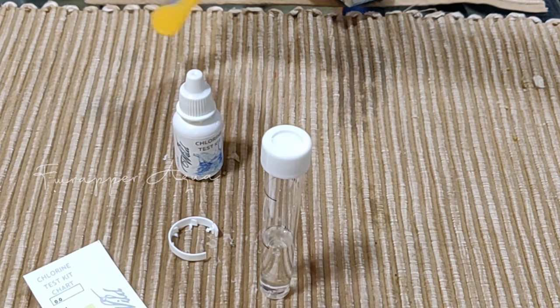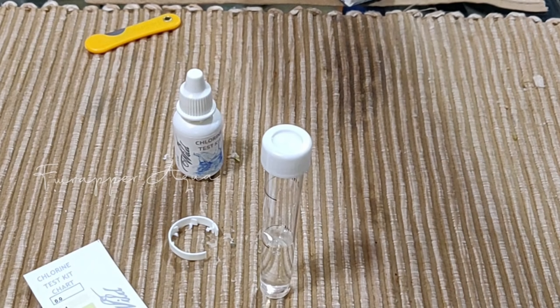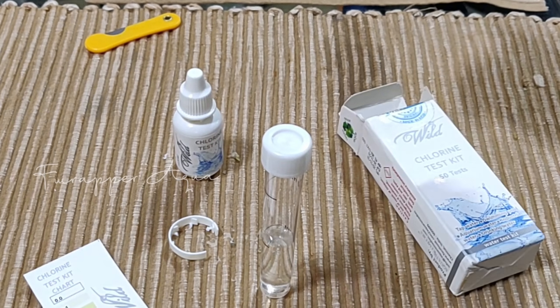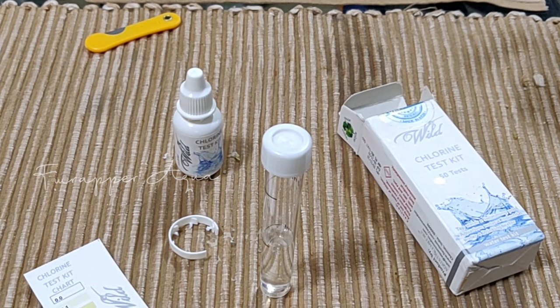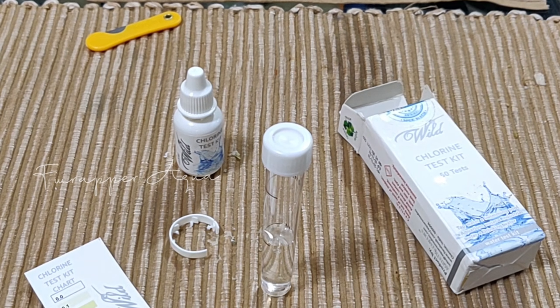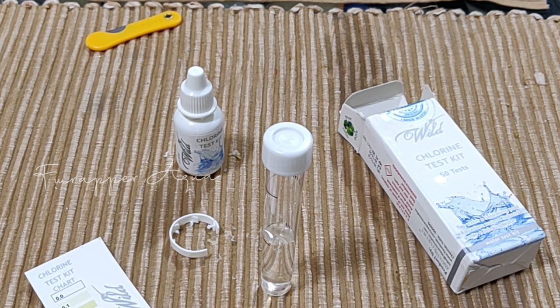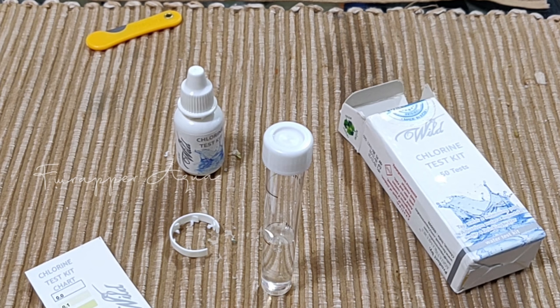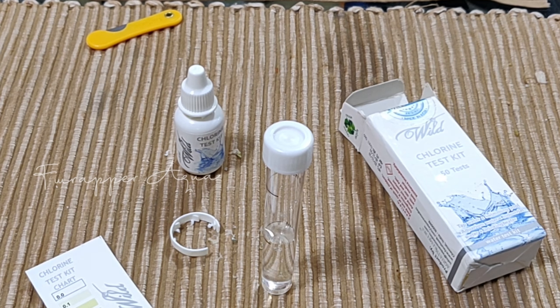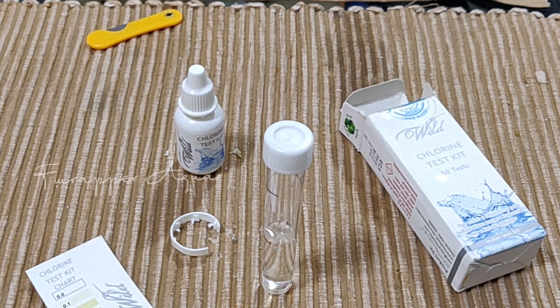So this is just a kit which is handy to keep, especially since a lot of people use direct tap water in their aquariums. It's not very expensive — you can just pick it up and keep it on hand. In case you have a doubt whether there is chlorine in your tank, you can just do a small test. These kinds of small test kits are always good to keep, especially if you are in the aquarium hobby. That's why I thought I should share this video.